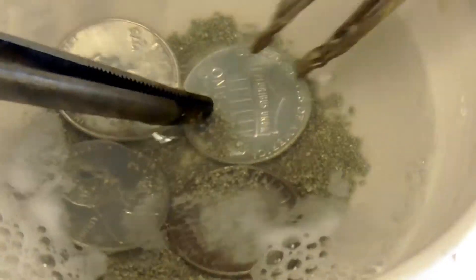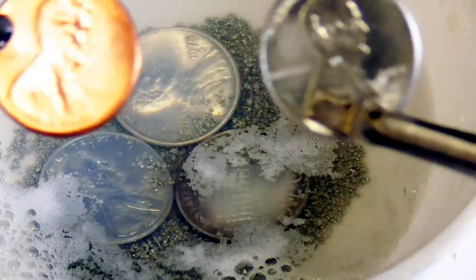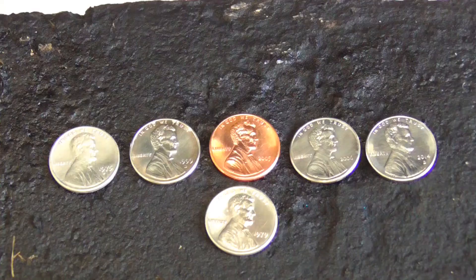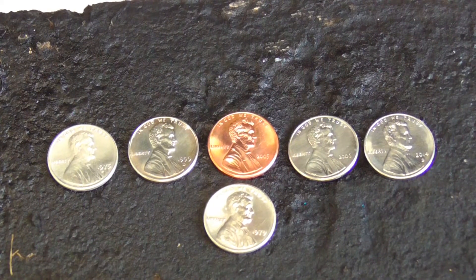After about 10 minutes of this reaction taking place, the result is a beautiful silvery coat on the surface of the pennies. Here you can see some of the tin coated pennies I made with an uncoated penny in the middle for comparison.